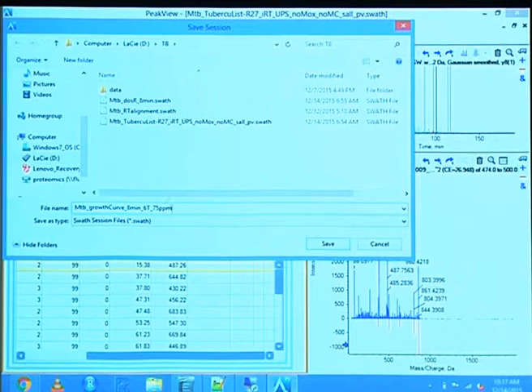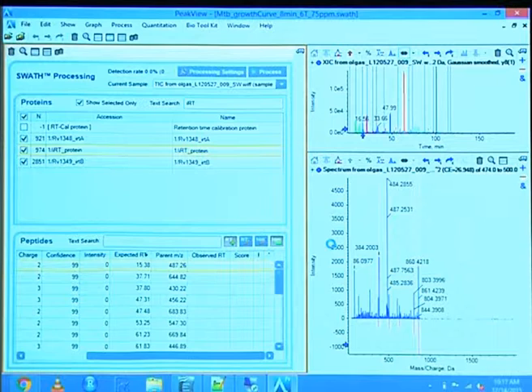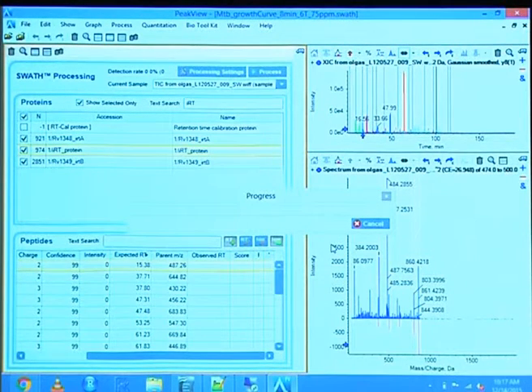Something like that. And then if you click Save, it'll take some time, and then it'll show you a window with the progress. I'm going to cancel that as soon as it shows up because, yeah, we would be here tomorrow.